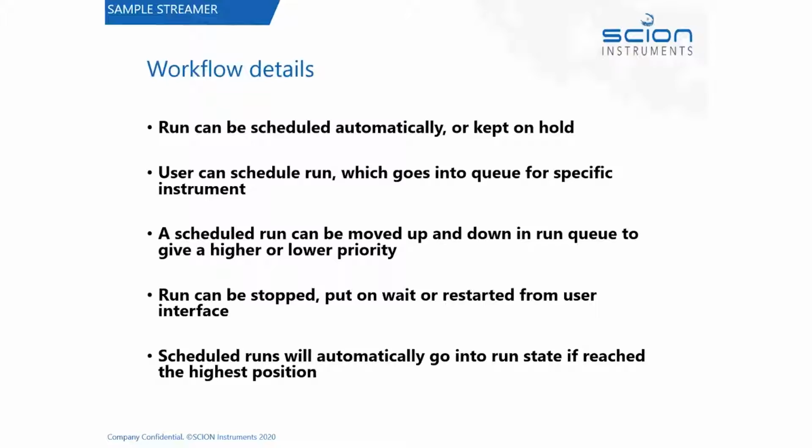and it sends the command to the instrument. However, the operator, before he starts the run, perhaps has to enter the internal standard weight, because that won't be available at sample reception. That will only be available in the laboratory when they are making up the standards. So you can make the run stay on hold until you enter maybe additional details that would be needed to successfully complete the run.